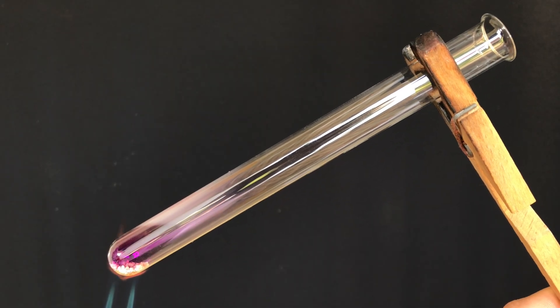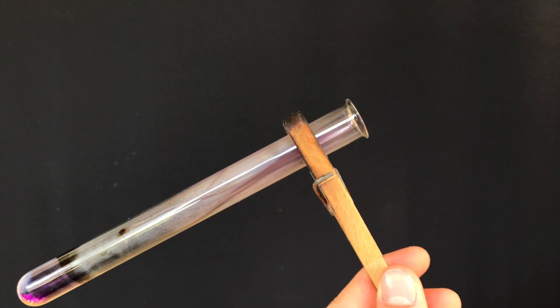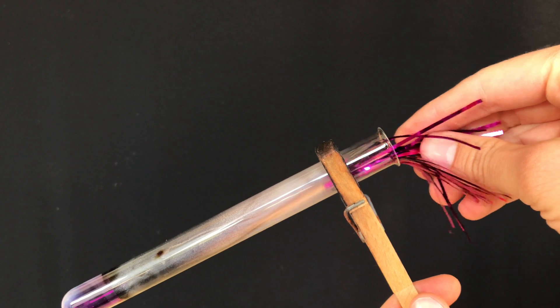I simply wanted to show you this very interesting oxidizing agent and there are plenty more oxidizing agents like iodine pentoxide, which releases oxygen and iodine when heated, and also mercury perchlorate.